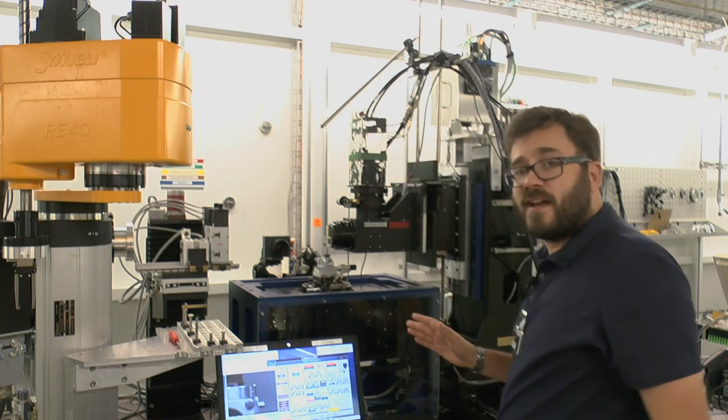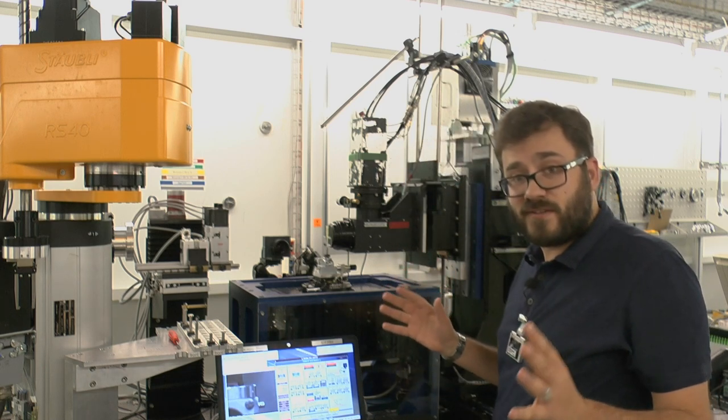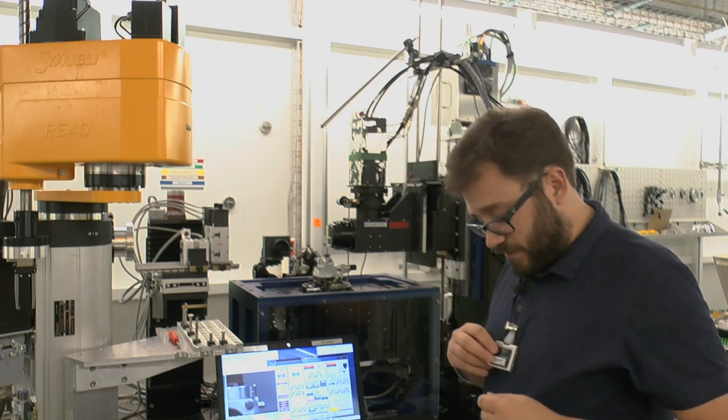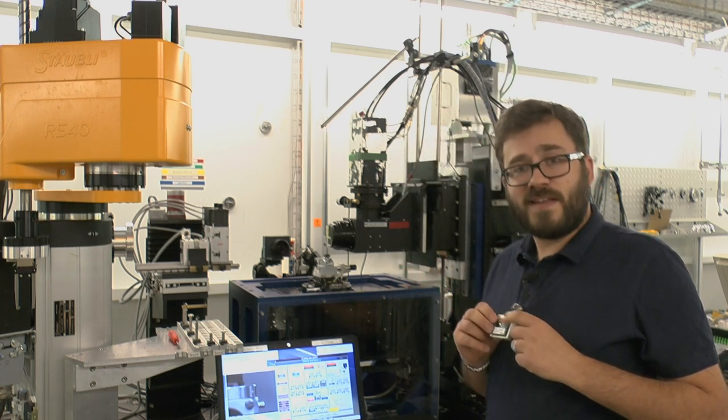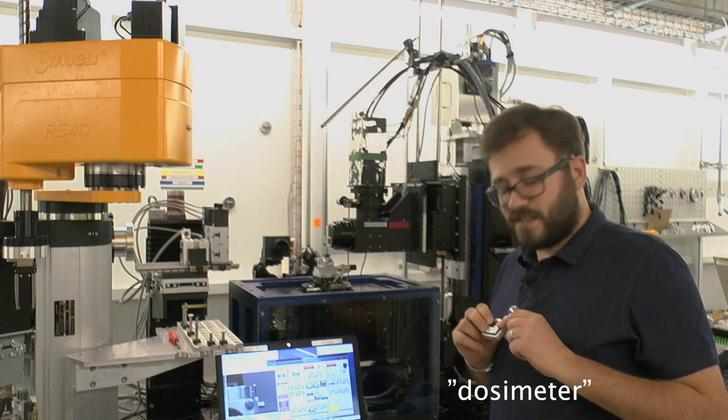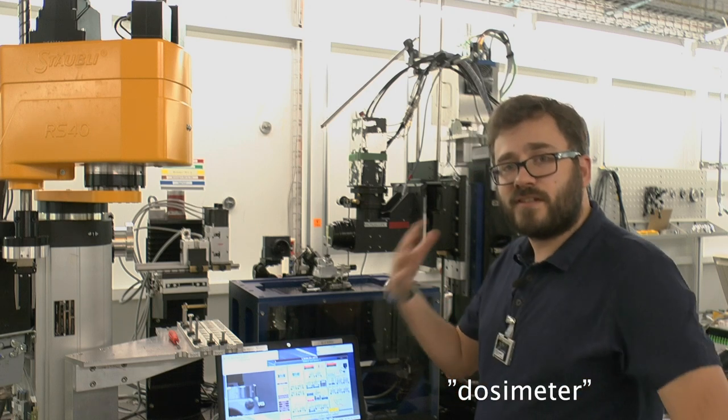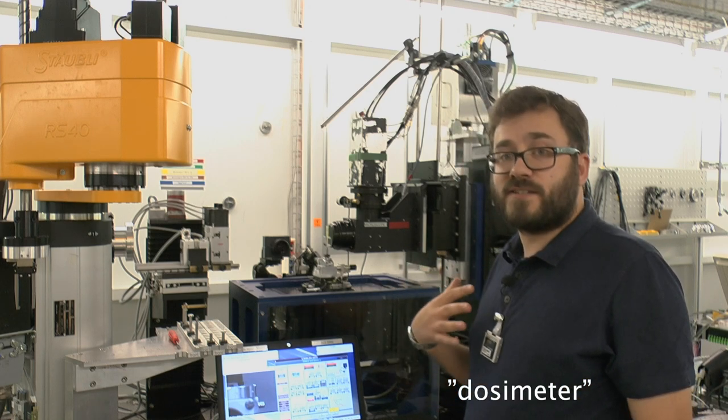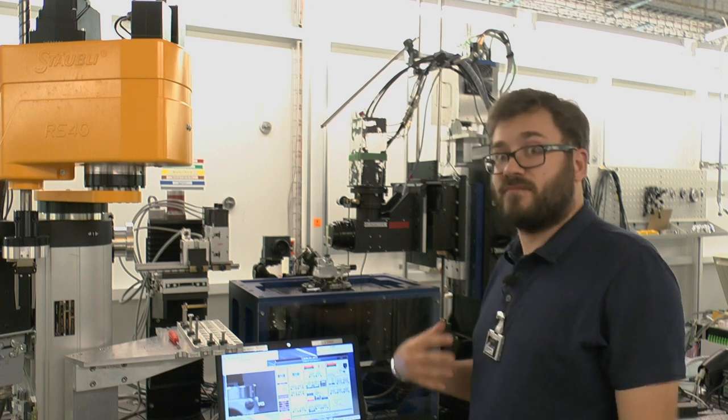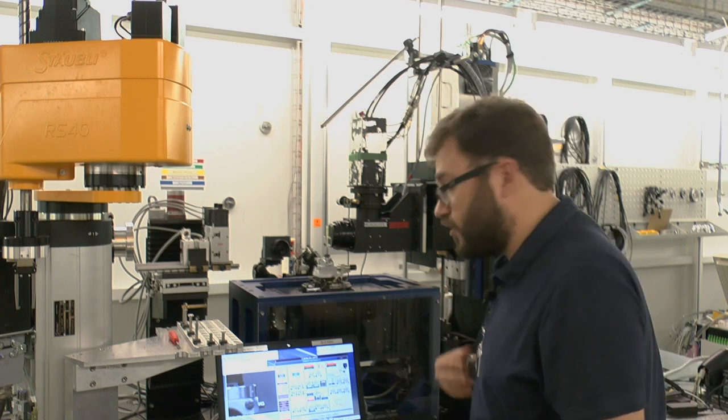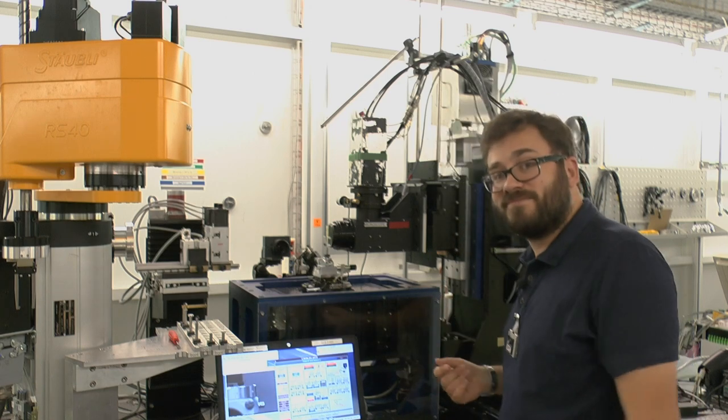So now it's ready to turn on the x-rays. And that's what this dosimeter is for. This is just to monitor how much radiation is getting picked up on me so I don't glow in the dark.